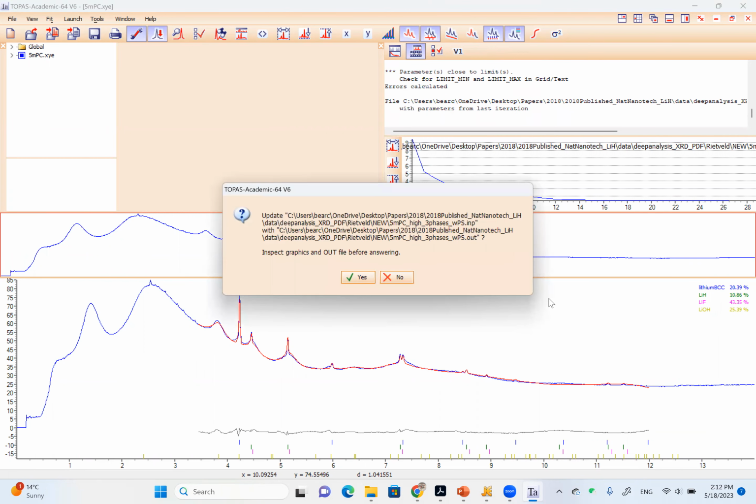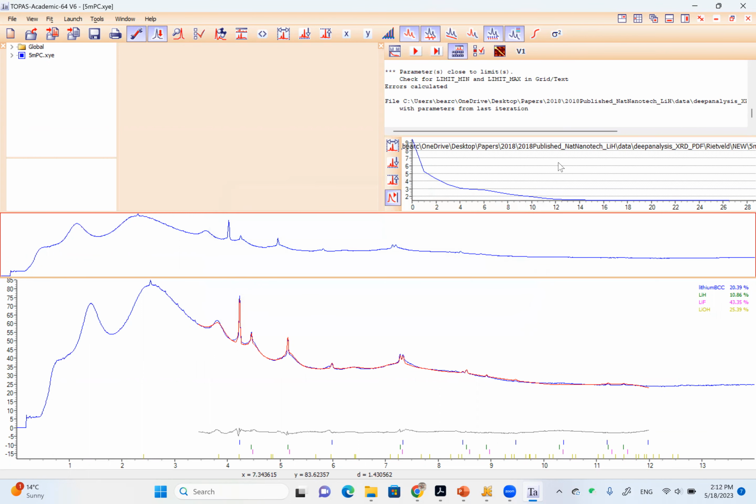I guess you guys get what I see here, right? Yes. Okay. So I do want you to pay attention to several things here, before we really go to the details. First thing is, you see this huge background, right? And keep in mind, all this so-called background comes from the sample. It's not from the container, it's not from the air, okay?